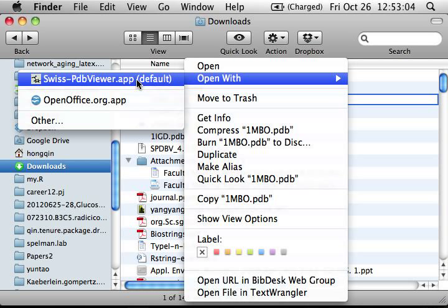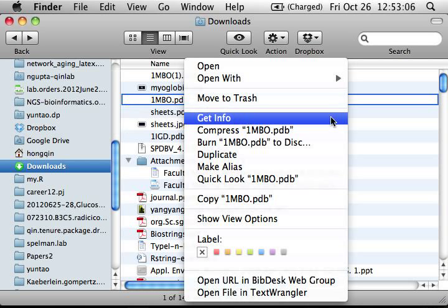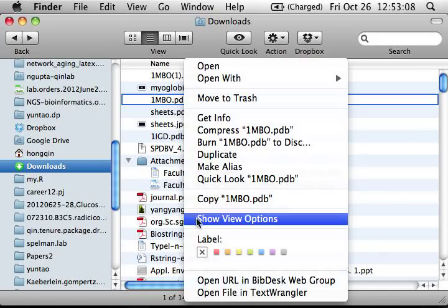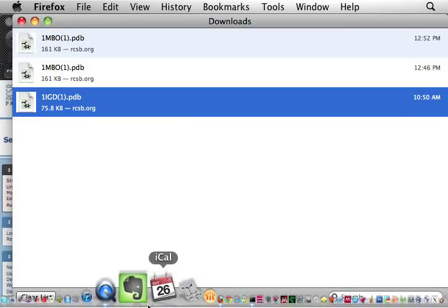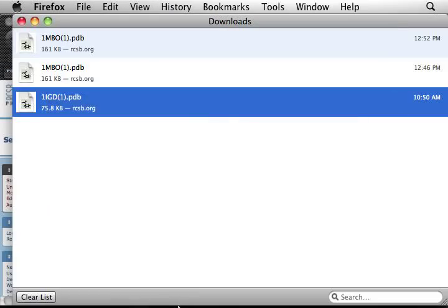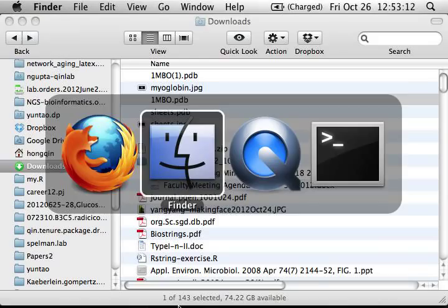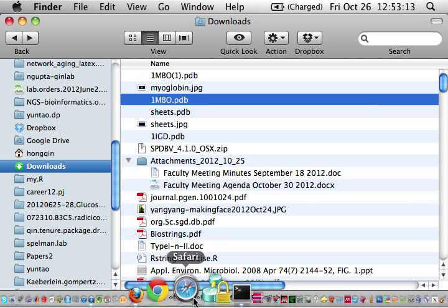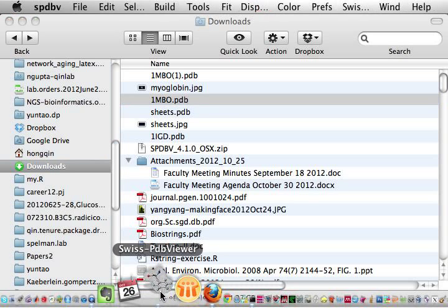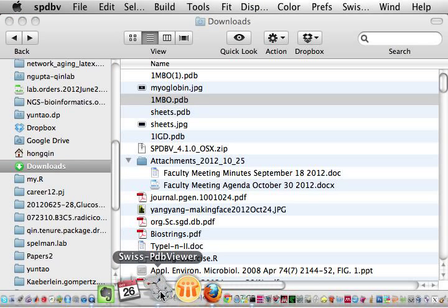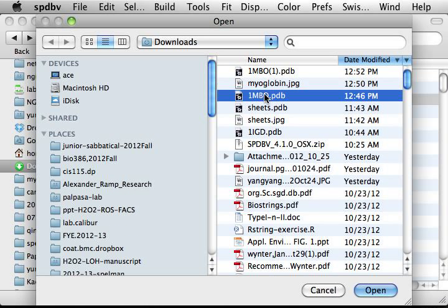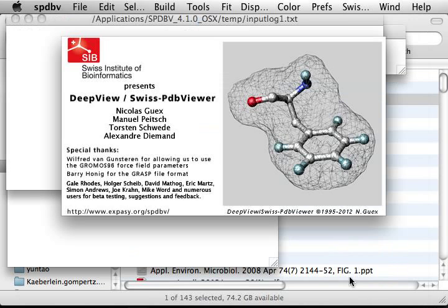Alternatively, you can also open the PDB viewer directly, then open the file and select 1MBO. Either way, it should both work.